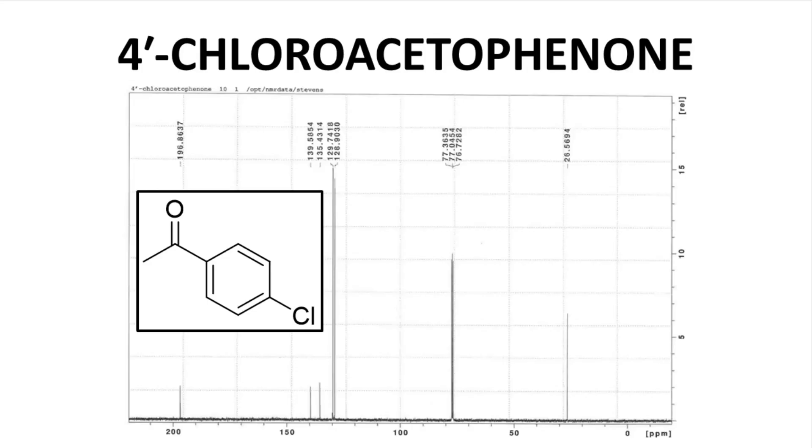Our last spectrum is 4'-chloroacetophenone. The molecule has eight carbons, but notice that our spectrum has only six peaks – six signals. 1, 2, 3, 4, 5, 6. Why don't we see 8 signals? It is because our molecule has a plane of symmetry.